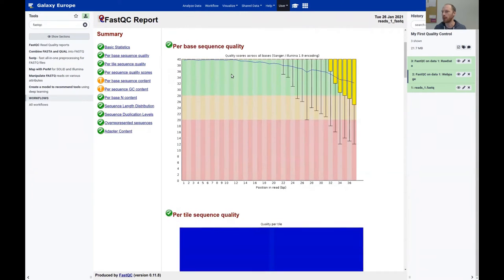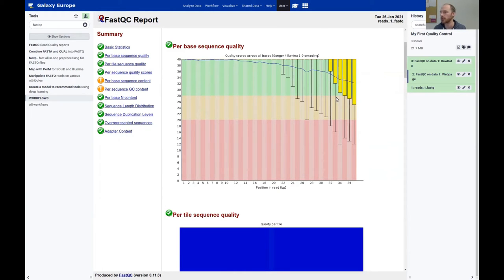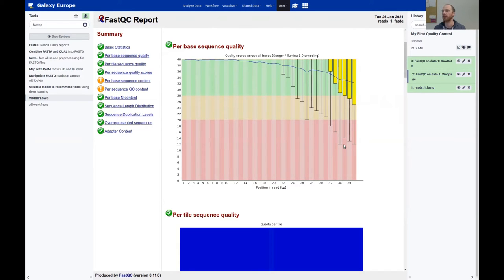Let's go to the first plot: per-base sequence quality. On the x-axis is the position in the read; on the y-axis is the PHRED score. Each position has a box plot showing the distribution of PHRED scores across the read library. The blue line is the mean quality. You can see the majority is in the green area — PHRED score above 28. Only the end bases have quality between 20 and 28, and only very few outlier reads go into the red zone.